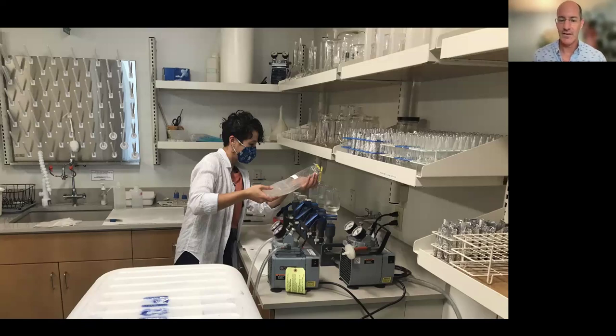So environmental DNA approaches are extremely sensitive to small amounts of DNA, and so we do things in as sterile a way as possible. This is a postdoctoral, well, at the time she was a graduate student at Duke University who was working with me on some projects, who's taking that water sample, putting it in these cups, and then filtering it through a really fine filter that captures the DNA and particles that might have DNA on it.